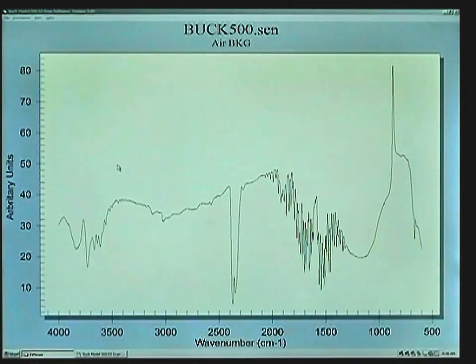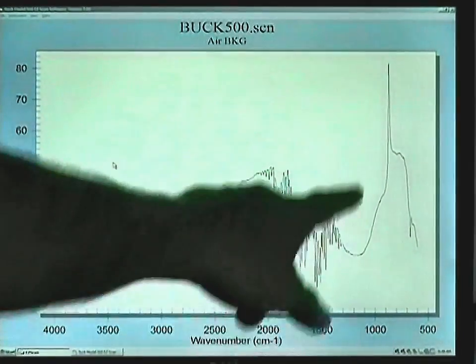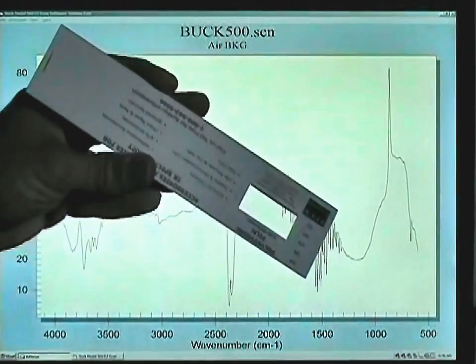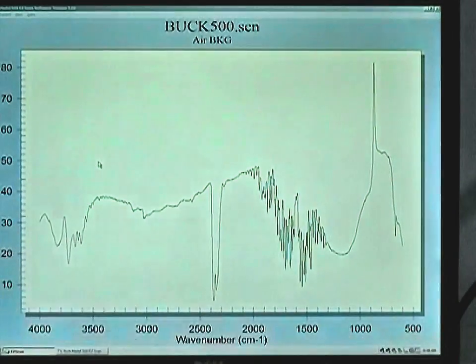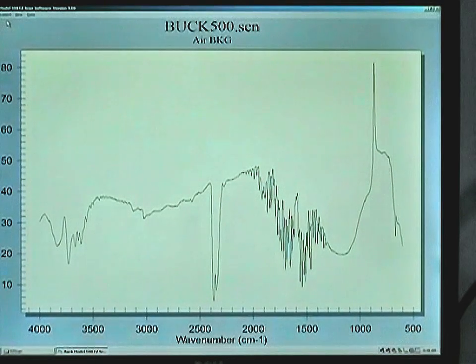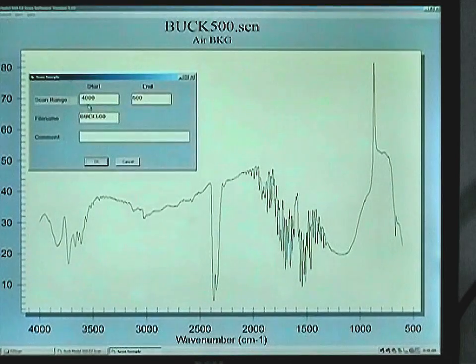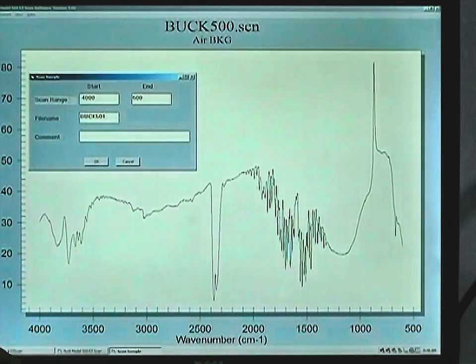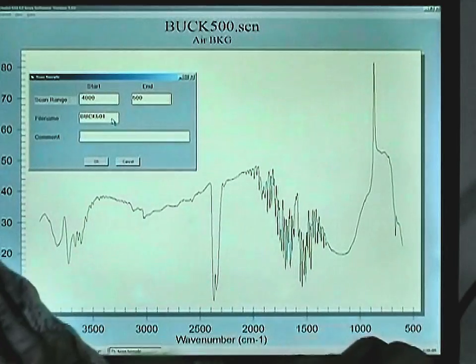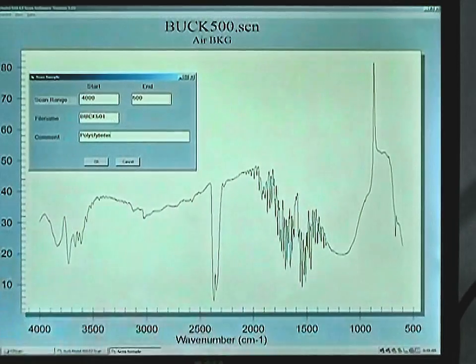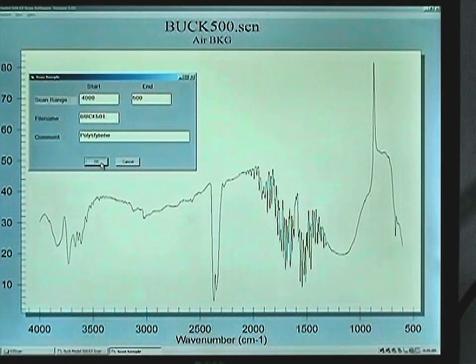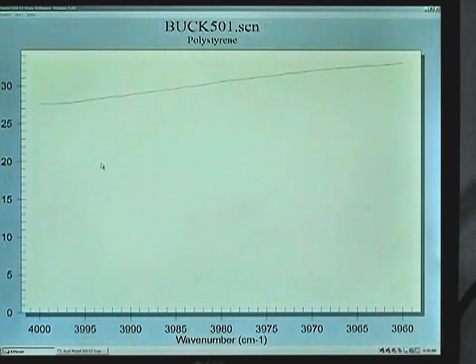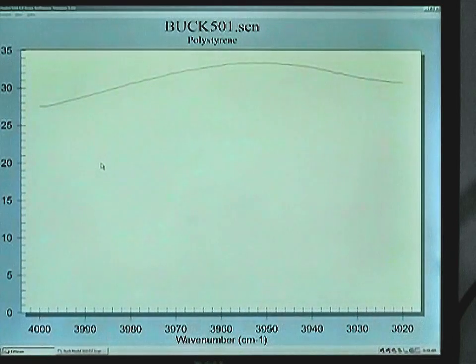When the single beam scan of the background is complete, you can see your profile of energy coming through the system. Take your polystyrene card, put it in the sample holder, click on Instrument, Scan, and when the sample ID window comes up, change the file name to Buc.501 or another appropriate file name, and put a comment in to identify the sample. Click OK. The system will reset itself and you will see the single beam spectrum of the polystyrene card being run.